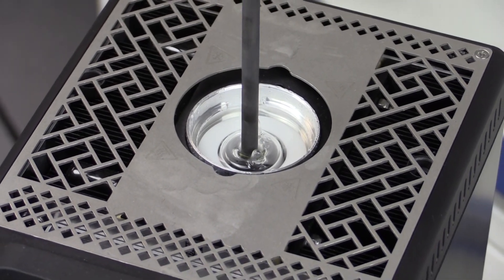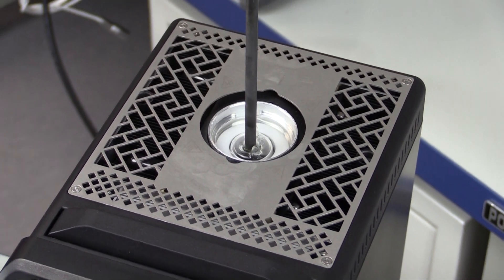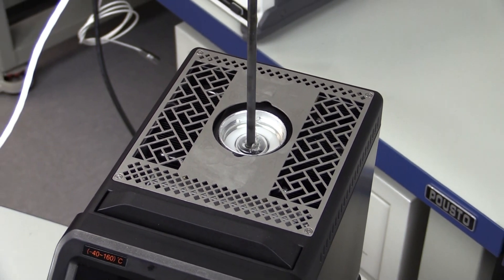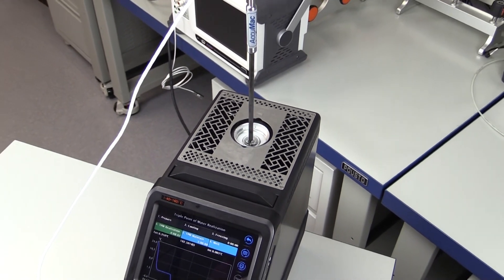Additel's 878160 reference dry-well calibrator is extremely versatile. In this video we will focus on just a few of the many amazing capabilities of this exciting calibrator and show you how to utilize the triple point of water realization feature.